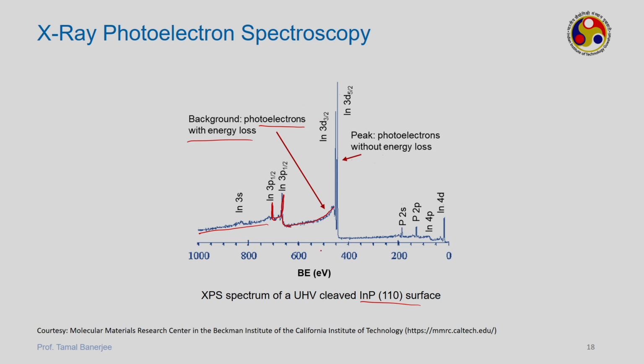So, likewise if you go to lower and lower binding energies, you will keep on getting those from the outer shell. I told you those which are in the outer shell will have the lowest binding energy. So, 4D, 4P, 2P, 2S likewise. Okay. So, this is very important. The detector will keep on recording the electronic energy data. It is only at those positions where a characteristic peak is recorded that determines the particular orbital.